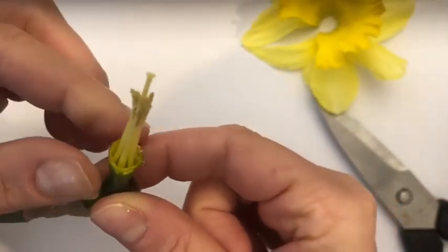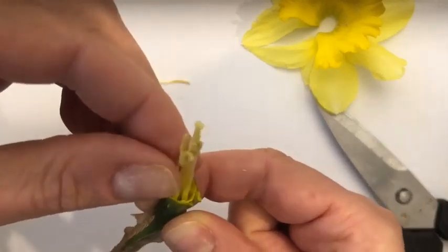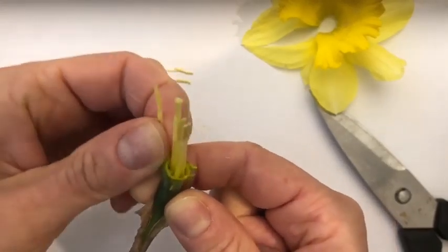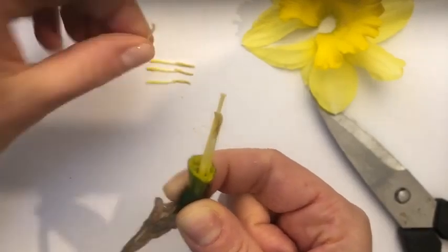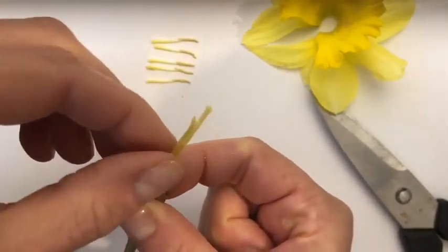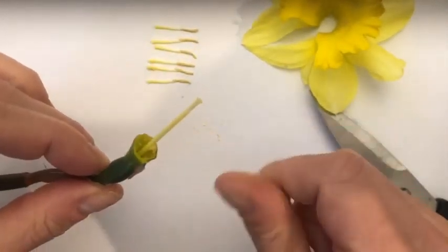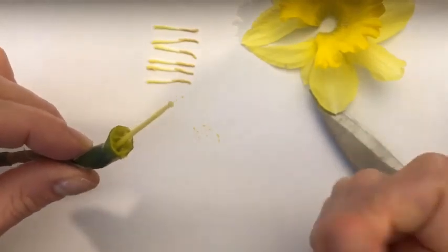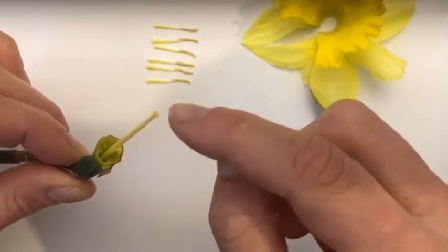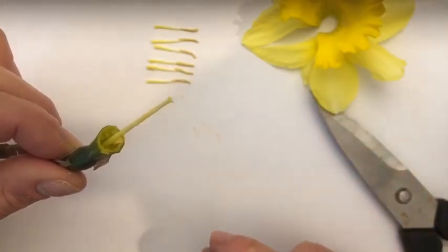I'm going to go ahead and pick or snip those off — let's see how many there are. I've got one, two, three, four, five, and six. So when a bee or other insect comes to gather some pollen to take it back to the hive, that's going to be a food source — it provides protein to the bees in the hive. It can't help but touching the top part of the female reproductive organ here, and this is again called the stigma.